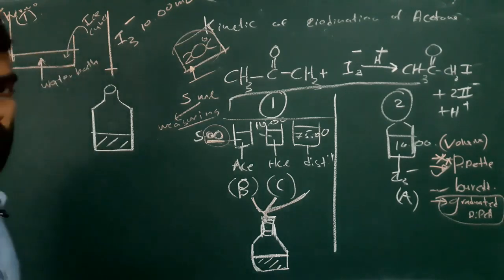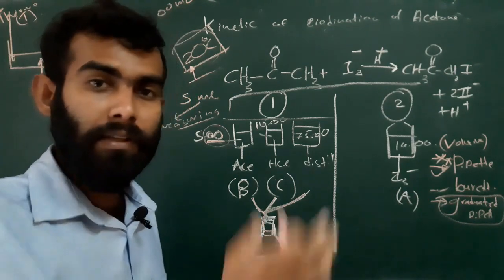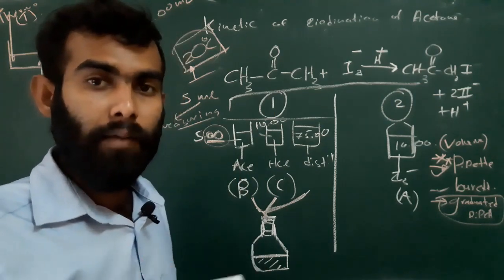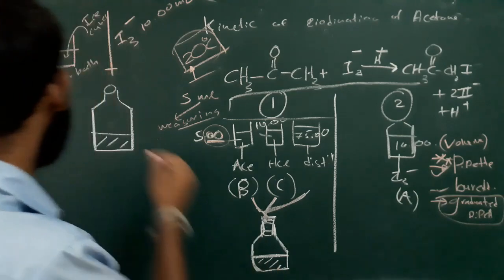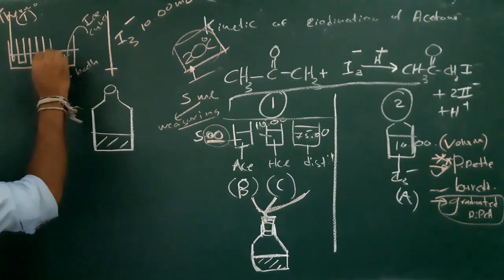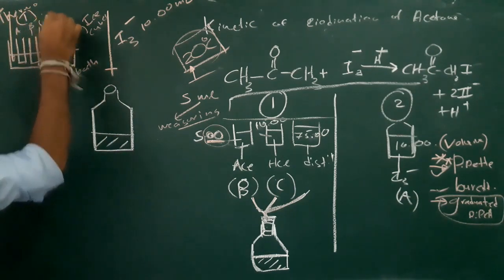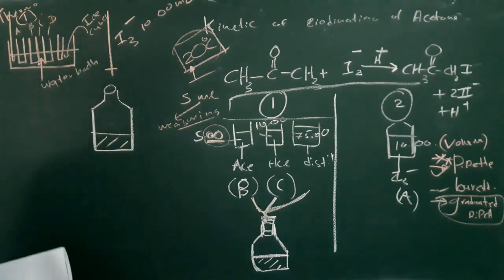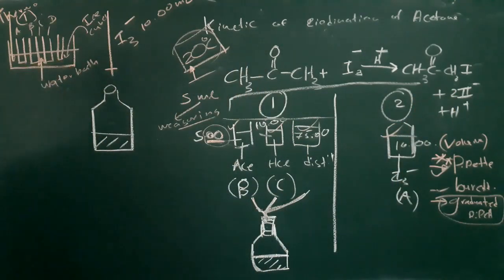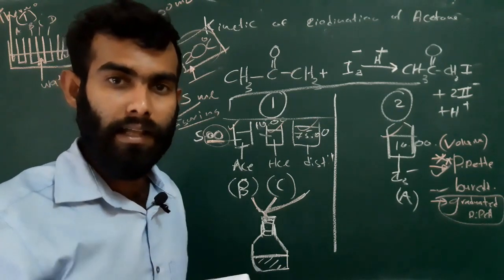So what is the first thing? We have to make a water bath and we will add some ice cubes and we will check the temperature. If the water bath is coming to 20 Celsius, now we can add our separate solutions A, B, C, D, likewise distilled water, and separately these solutions we have to keep in this water bath, and we have to check whether they are in the correct temperature, 20 degrees.